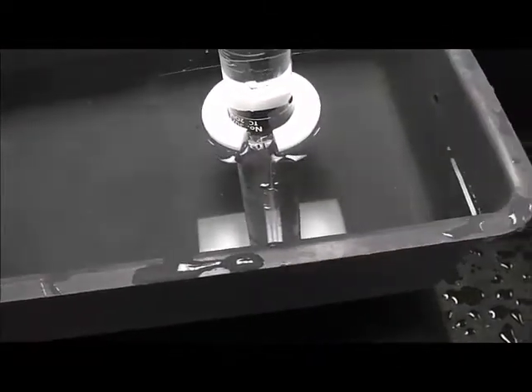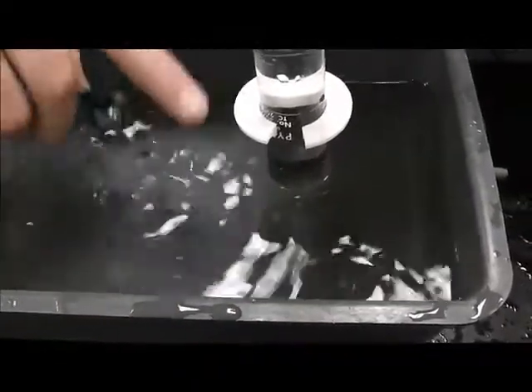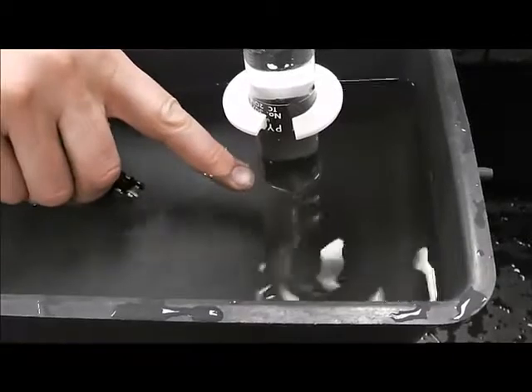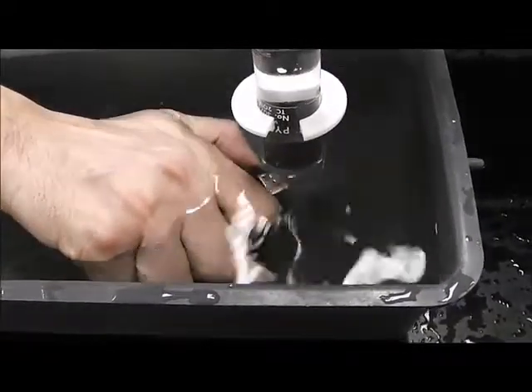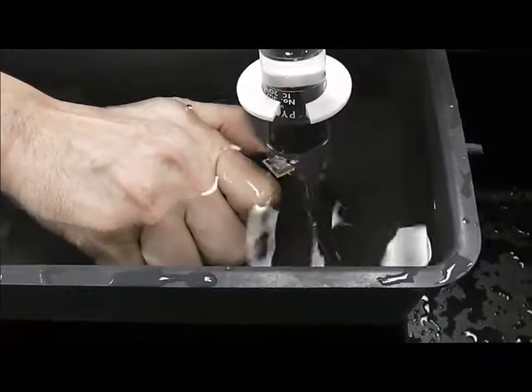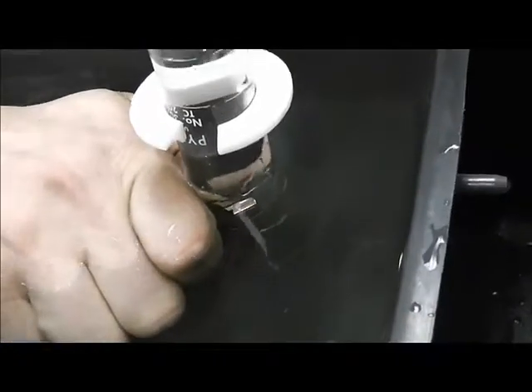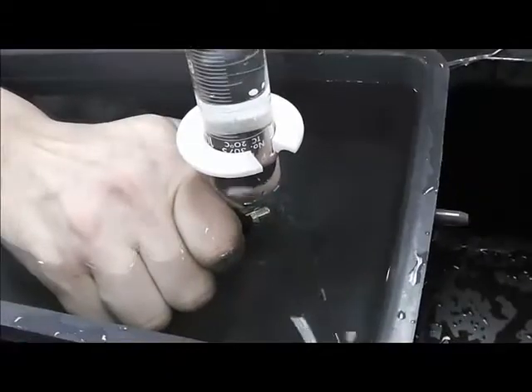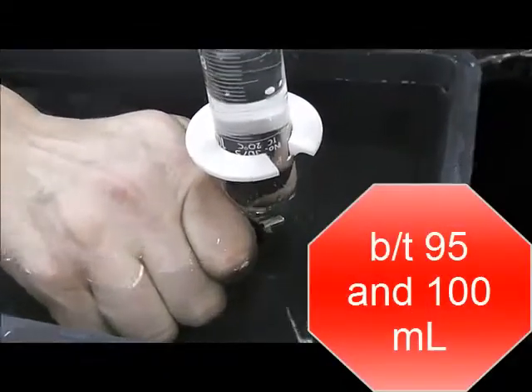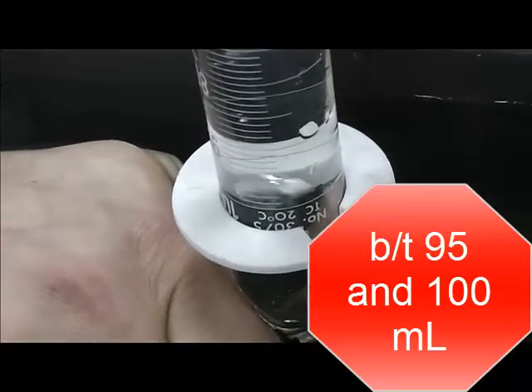Next step, take your butane lighter and pick the graduated cylinder up. That water will stay in there as long as you don't bring the top of the graduated cylinder over the level of the water. You can hold it underneath, and as it's underneath the graduated cylinder, push on the thumb and the gas is going to come out. This is going to take a little bit of time, but you should be able to fill up the graduated cylinder. You want to stop somewhere between 95 and 100 milliliters.